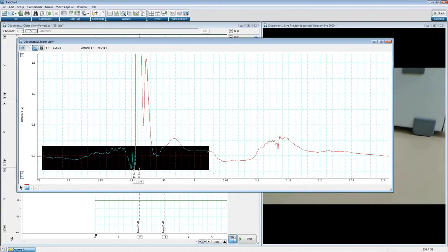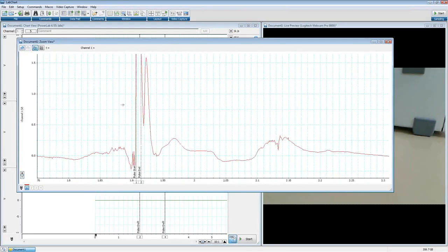Say we have our threshold right here at 0.5 volts. Now you can see we've gone up, and then we've come down, and we've gone below that 0.5 volt option. We may not want it to turn the fast response output off at that point. Hysteresis is a percentage value. It's a percentage of the total range that we're recording in, so a percentage of 10 volts. If it does not go below our threshold of 0.5 volts by more than 10% of 10 volts, it's still going to keep it triggered.